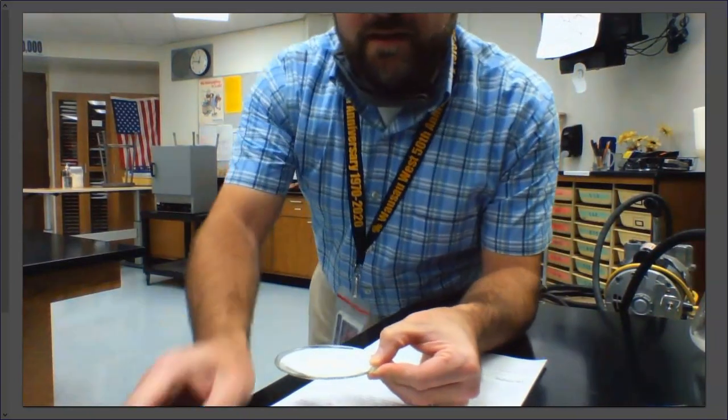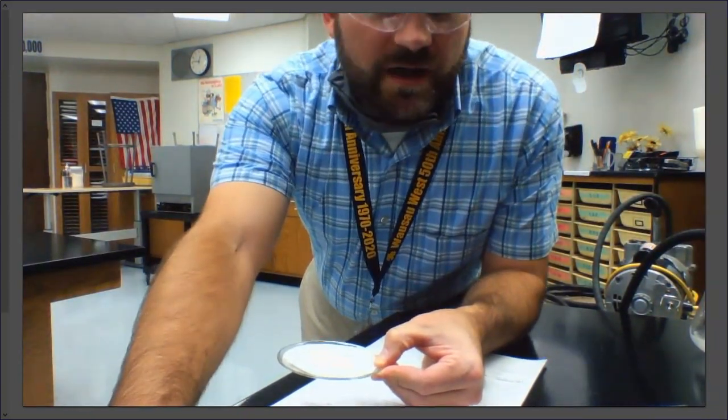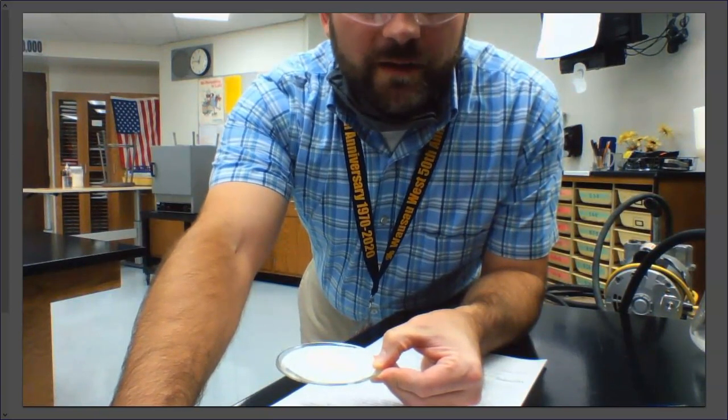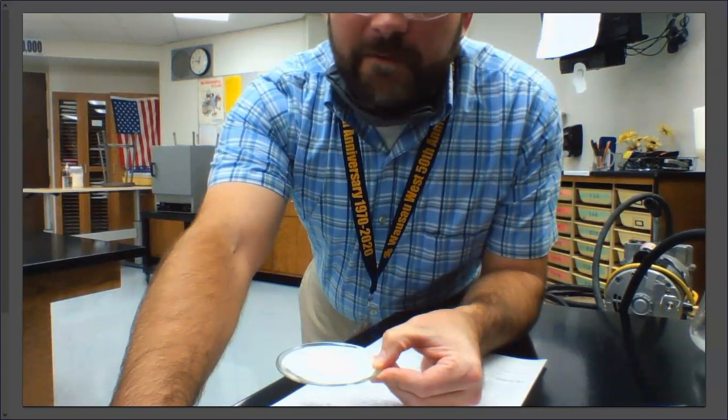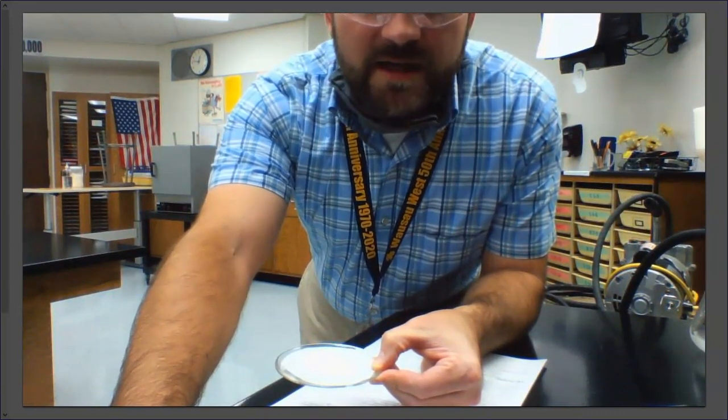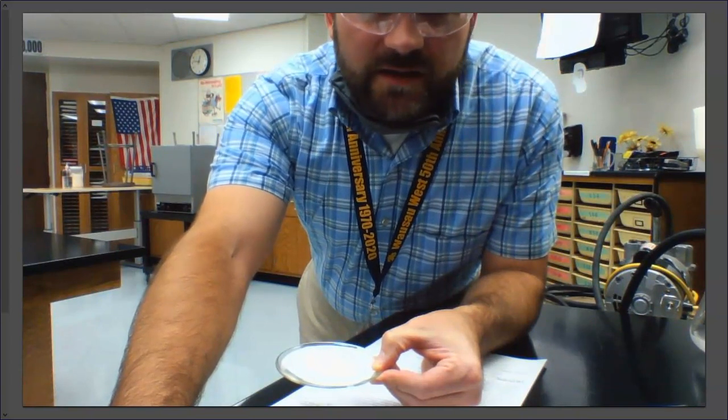It's really no different than the oven you have at home. But obviously it's for chemical drying and things like that. So I'm going to place this in the oven. We're going to let it dry. I'm going to take the mass, and then I'm going to place it in the oven again, let it dry again, take the mass, so on and so forth a couple times. And then we'll have our final results, and we can analyze the data that we've collected today.